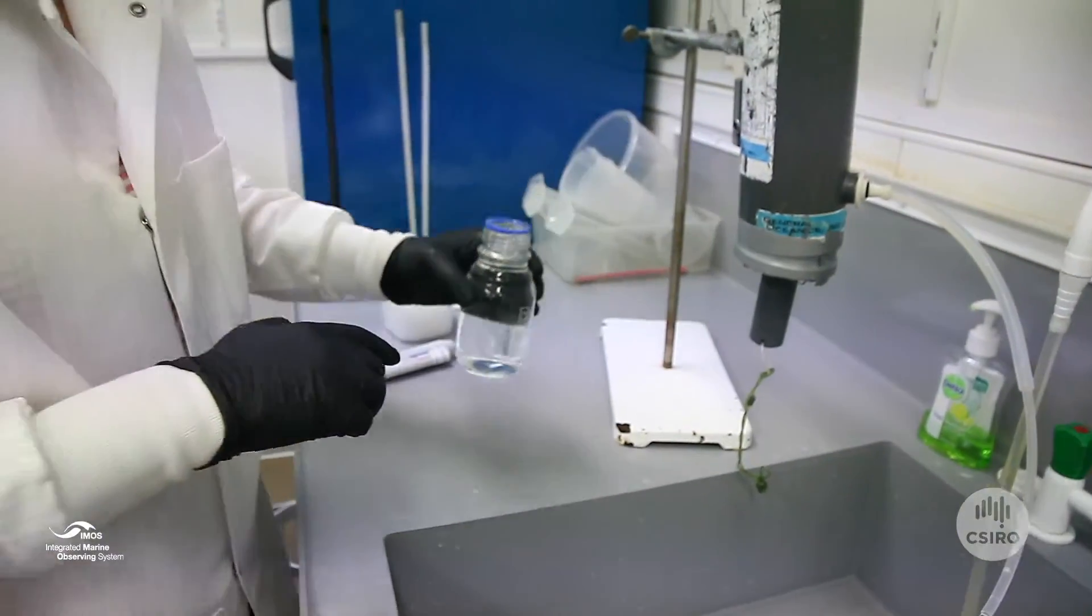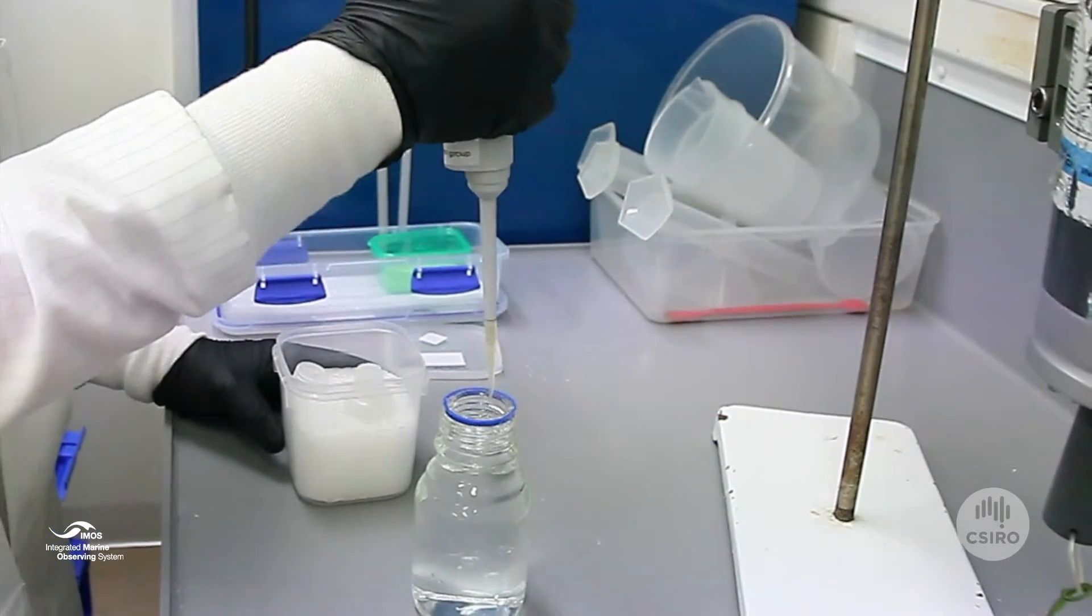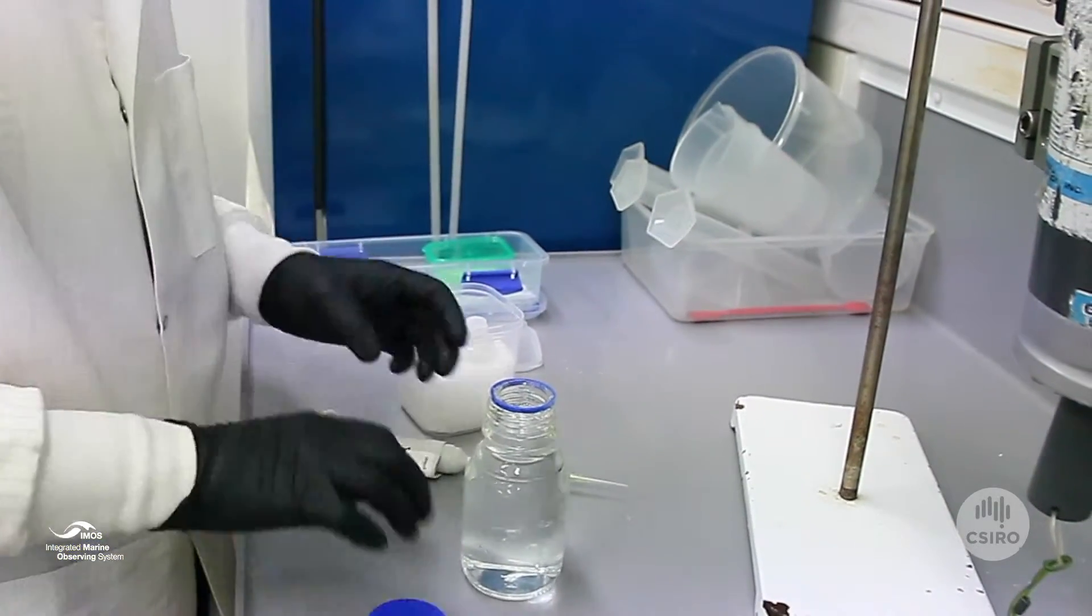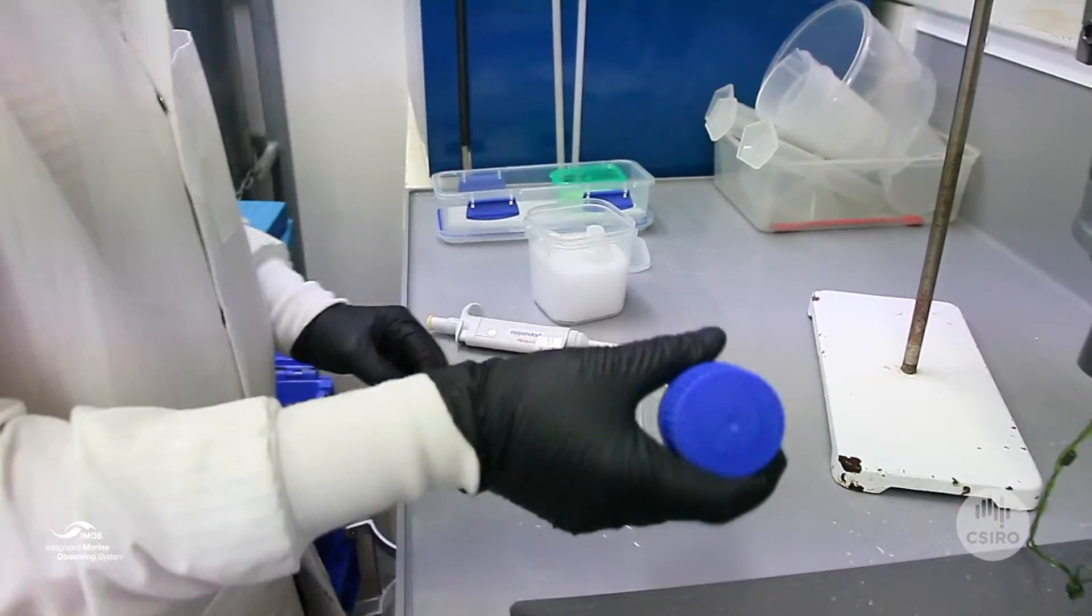Poison the sample with one squirt. Put on the lid and invert twice. Put it back in the box.